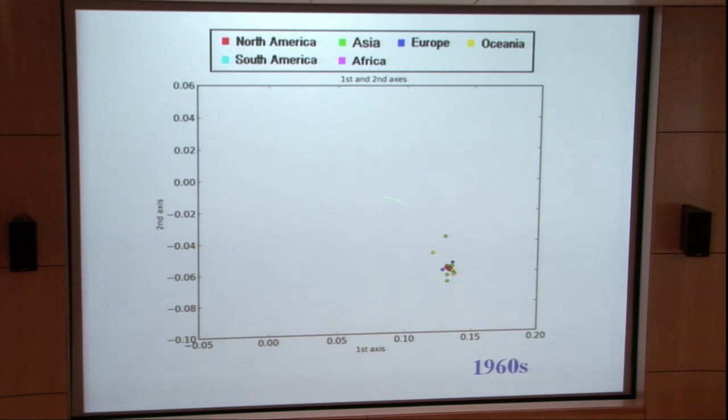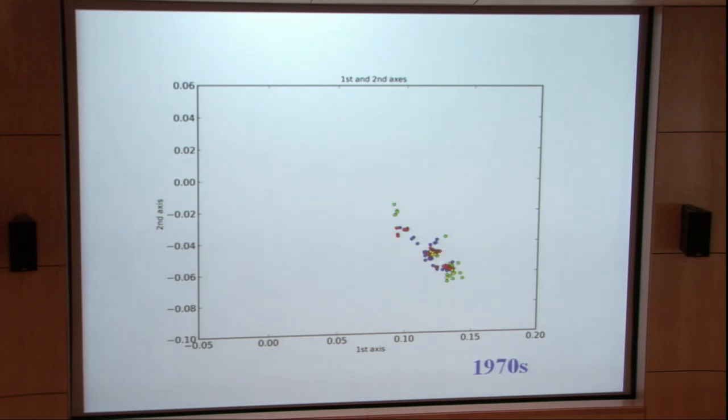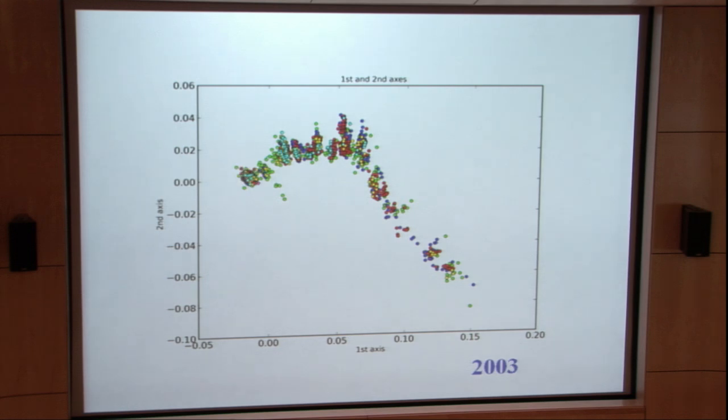I've blotted out all of the sequences except the ones from the 1960s. And if you then show the ones from the 1960s and 70s, they go like this. You get more sequences in different parts of the world. In the 1980s, sequencing is taking off and freezers were getting bigger and people were collecting more flu samples. In the 1990s, that happens on a much bigger scale. There are systematic programs to start collecting these sequences. Then just one year at a time, year 2000, 2001, 2, and so on. So that's just a pretty picture to finish with, okay?